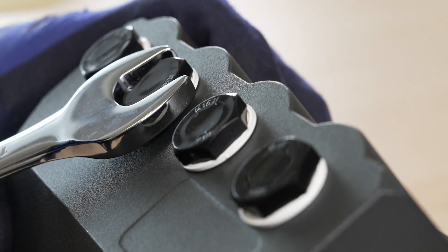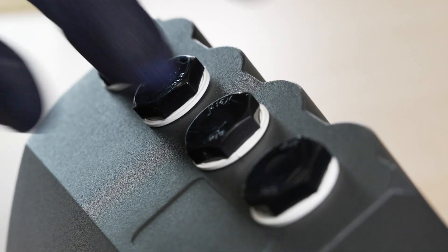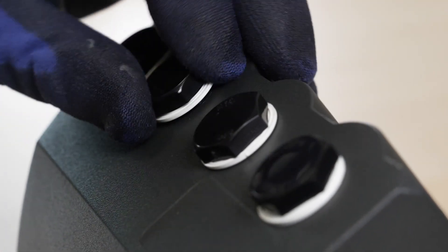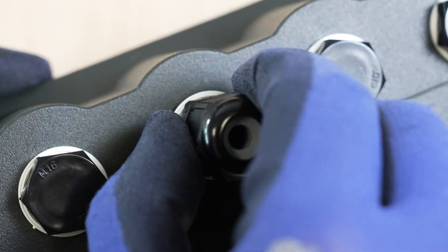Using your spanner, remove a blanking plug in the back of the N module. You may need to remove more depending on the number of functions being wired in. Screw in the cable gland which comes with the accessories kit.